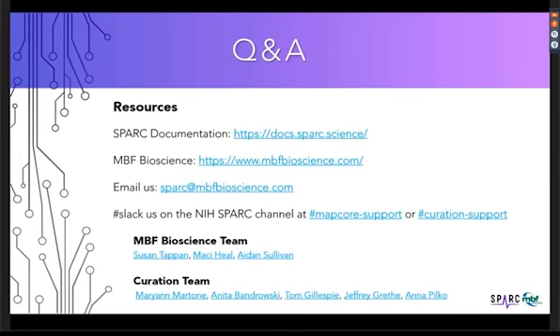If you have image data of any type that goes along with other experimental paradigms that you're after, we can help ensure that your data is captured and represented on the portal in as many ways as possible to make it a really rich experience for other people, including yourself, your colleagues and other interested researchers to explore the data sets once they're made public.